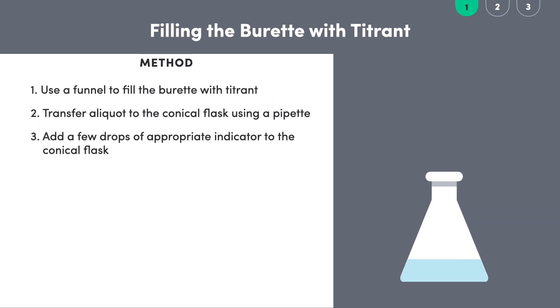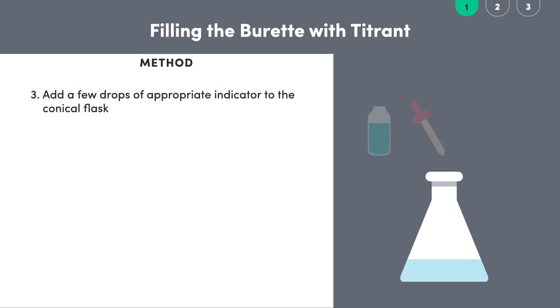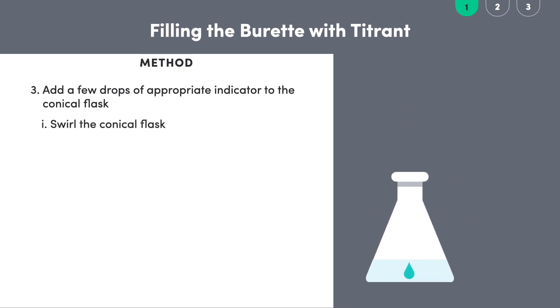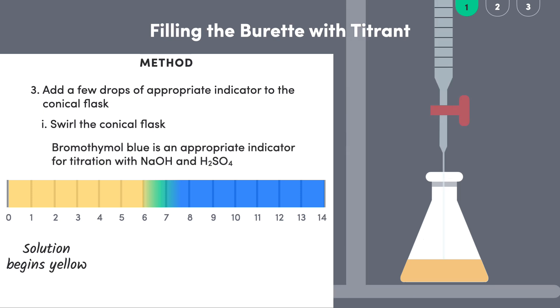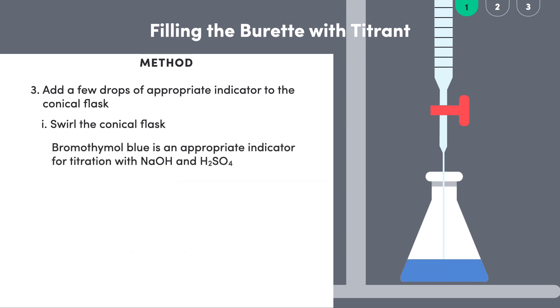Finally, just before we begin the actual titration, we add a few drops of an appropriate indicator to the conical flask and swirl to make sure it's all mixed in nicely. In this titration, we'll use an indicator called bromothymol blue. This is yellow below a pH of 6, so it'll be yellow when we add it to the sulfuric acid. But as we add sodium hydroxide from the burette, the pH of the solution in the conical flask will increase and the solution will completely change color to blue at a pH of about 7.6. To make it easier to detect this endpoint, it may be useful to place a piece of white paper onto the flask before the titration begins.